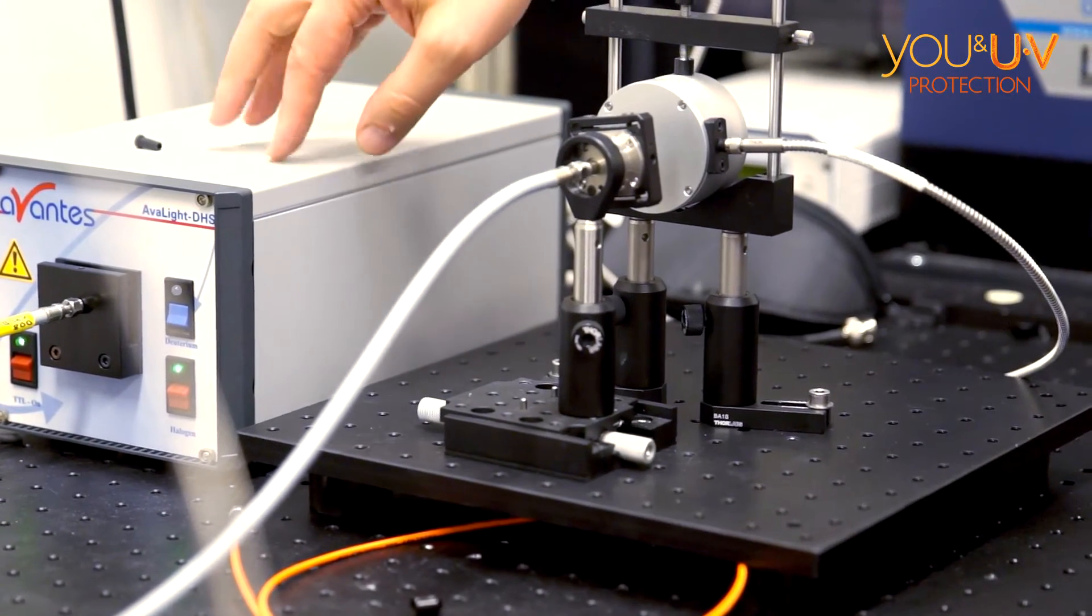There's a second lamp in here, which is basically deuterium, an isotope of hydrogen. When you pass a spark through it you get a lot of UV light out, and that's the source for UV.